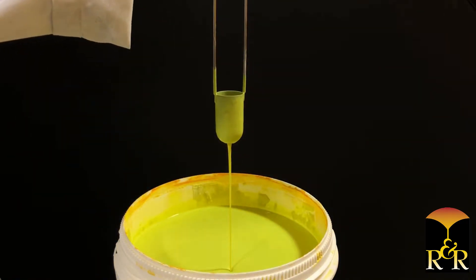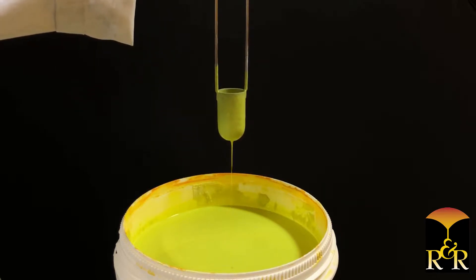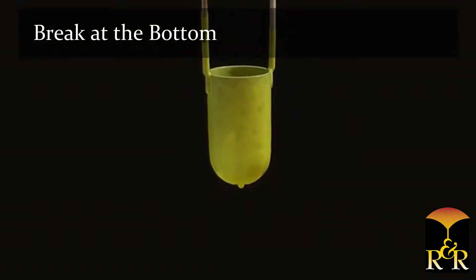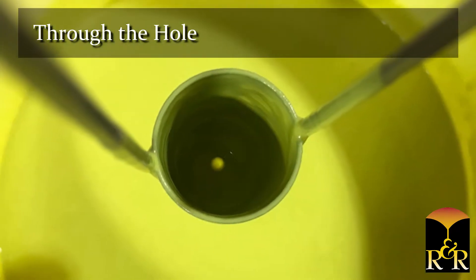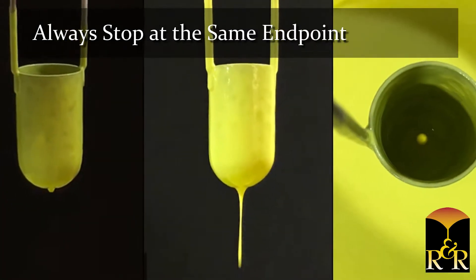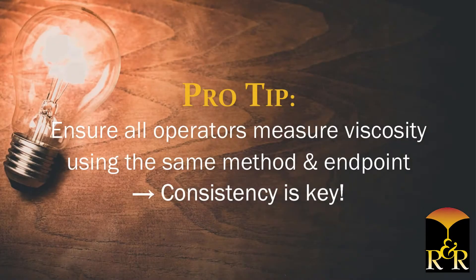Start the stopwatch immediately once the cup clears the surface of the slurry. Stop the stopwatch at one of the following three endpoints: Break at the bottom — watching from the side of the cup when the slurry breaks at the bottom of the cup. One inch below — watching from the side of the cup when the slurry breaks one inch below the bottom of the cup. Through the hole — looking down into the cup when daylight can be seen through the hole. The stopwatch should always be stopped at the same endpoint.